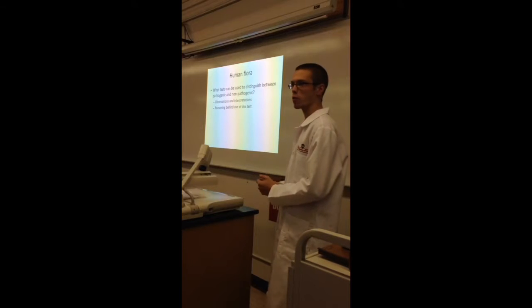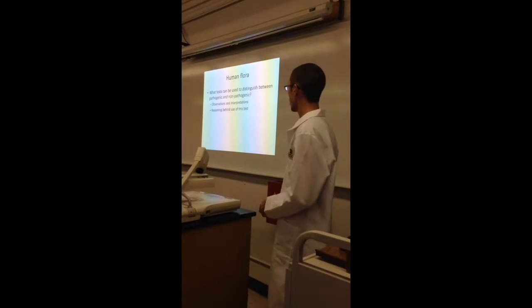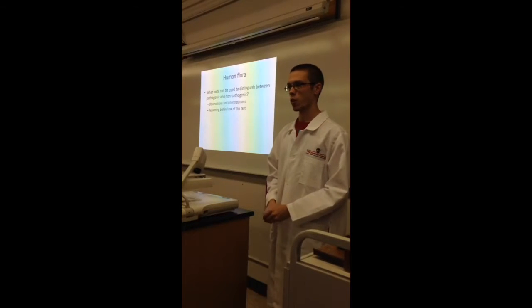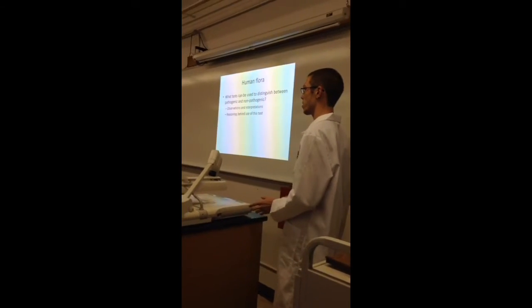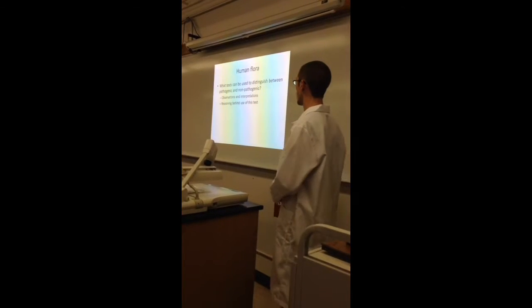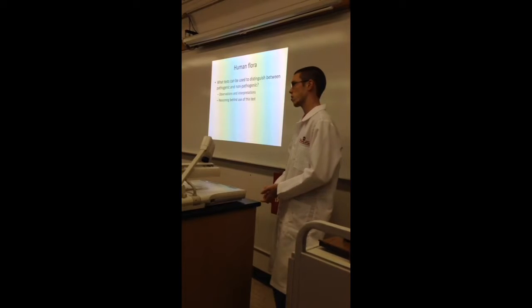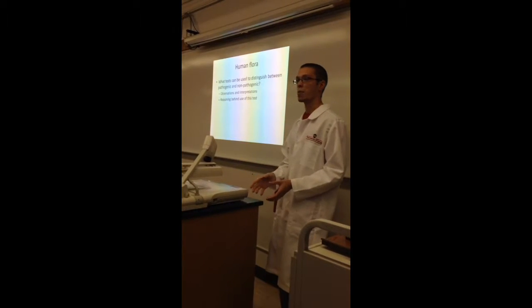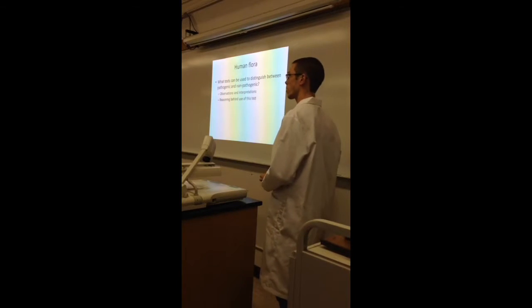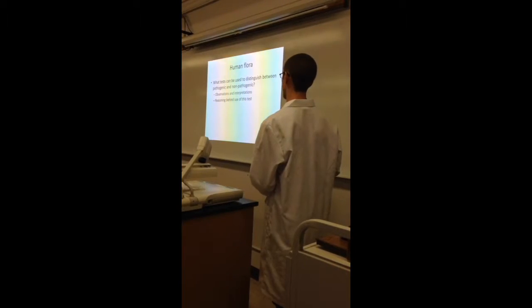So you should be able to look at those results, and based on this test and a couple others, determine whether or not you think an organism is pathogenic or non-pathogenic. So these aren't completely finished tests. If you just do blood agar and you get beta hemolysis, for example, that doesn't necessarily mean that you have a pathogen, but that sort of puts it into that bin that it could be a pathogen. So they're not conclusive, but they help you narrow down the field. So that's what we're looking for here.